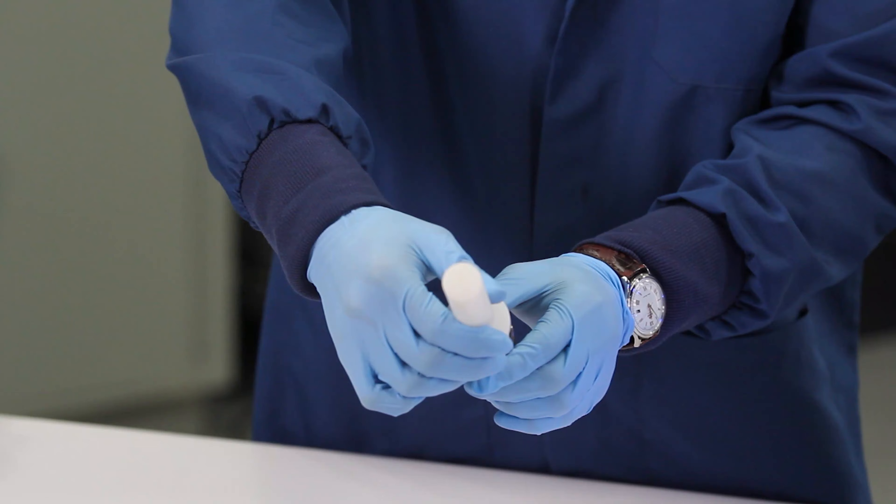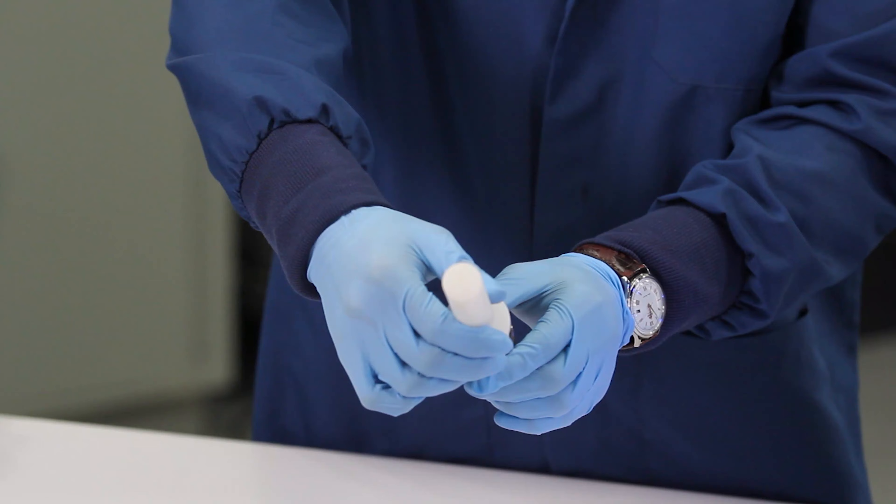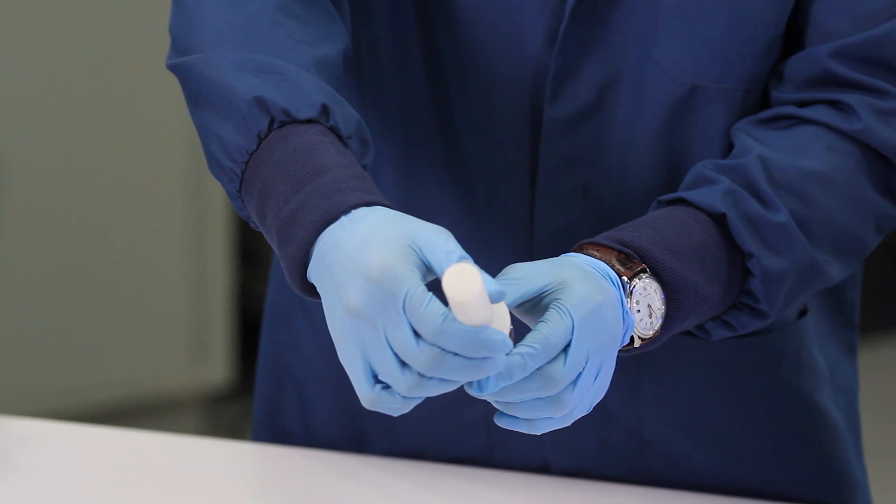Hey guys, this is the Q-Screen, meant to be used with the Q-Cup for the Edge Automated Extraction System. What the Q-Screen does is it is there to help compress the sample and also keep the reaction chamber clean.